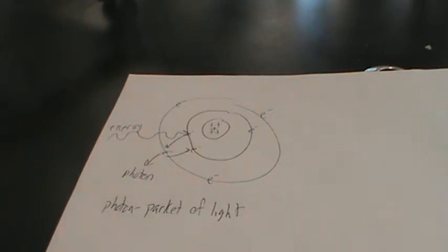And also with this lab, I'm going to have three unknowns that you're going to need to identify from the knowns. So I'm going to go through the knowns, tell you which one is which. I want you to write down the color that you see of the flame. And then with the unknowns, correlate or see which known matches up to the unknown. And if you have any questions about this, once again, please shoot me an email. I'll answer them.